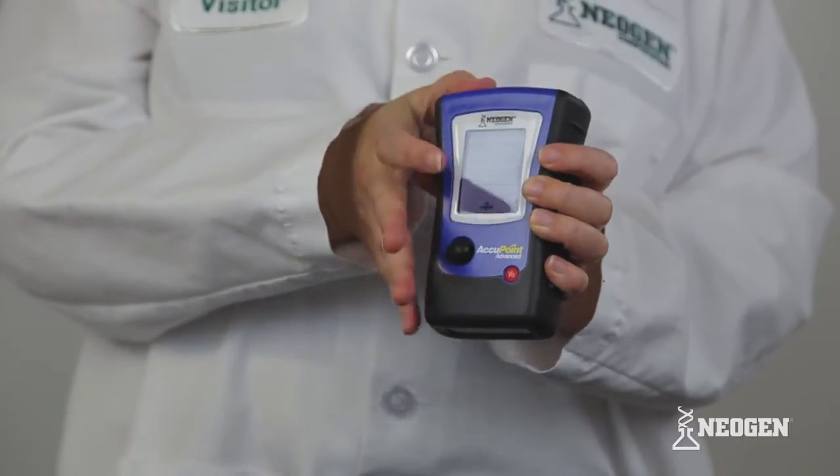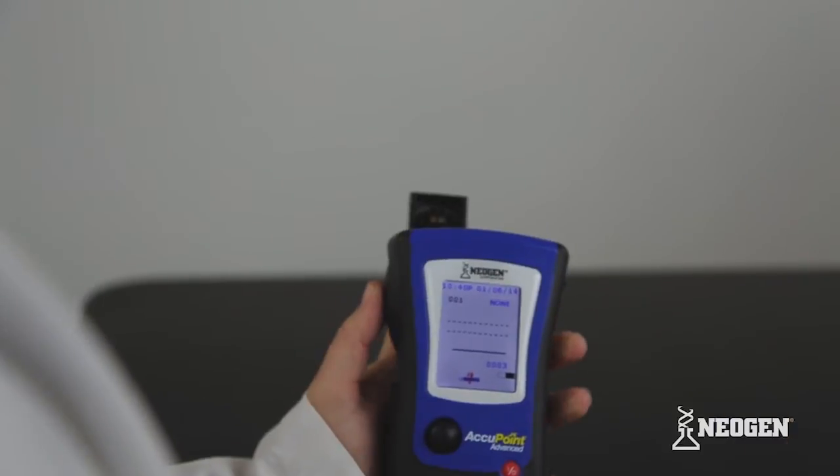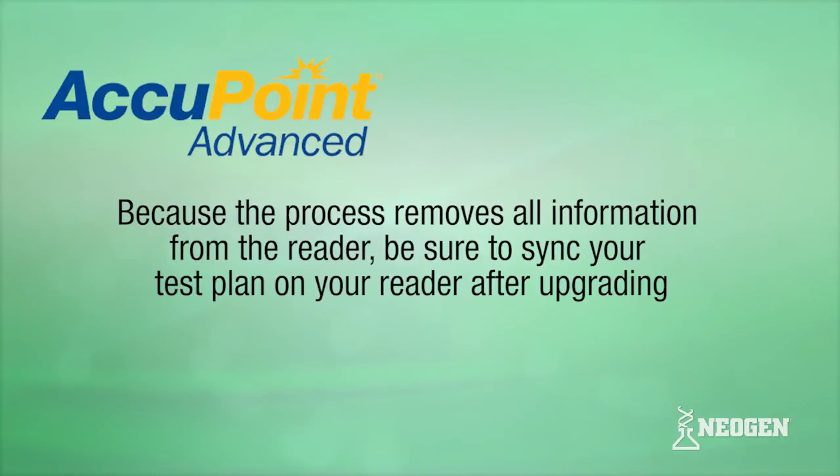Keep the reader upright during readings and always remove the sampler after testing is complete. Because the process removes all information from the reader, be sure to sync your test plan on your reader after upgrading.